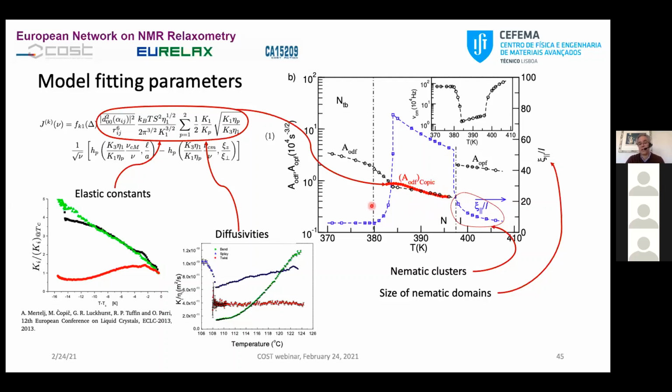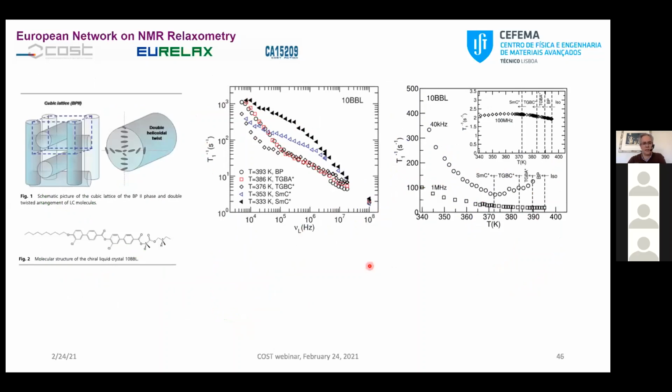So it is interesting to have models because of this possibility. It is possible to use another experimental technique, and if we have a model that correlates these 2 variables, it is possible to check if our interpretation is correct or not.